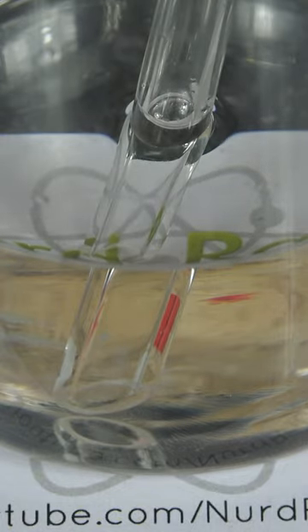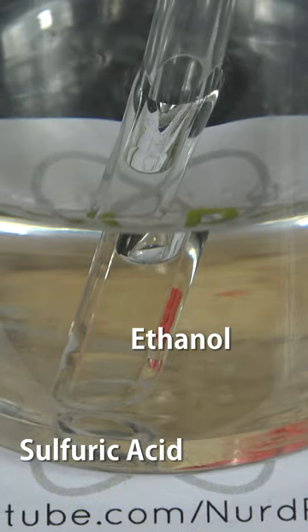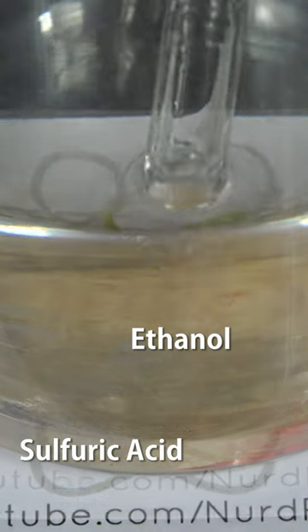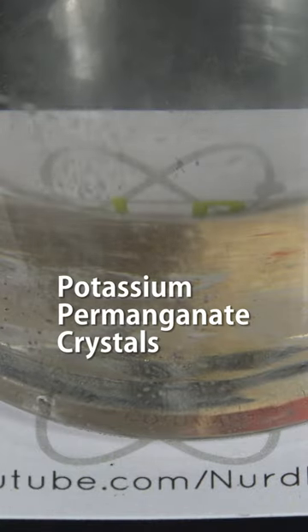To make a thunderstorm in the beaker, carefully pour concentrated 98% sulfuric acid into alcohol through a funnel to create a biphasic system with acid on the bottom and alcohol on top. Now carefully sprinkle in some potassium permanganate and watch the thunderstorm.